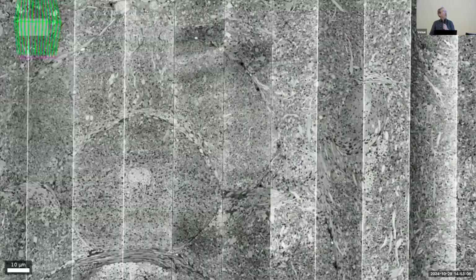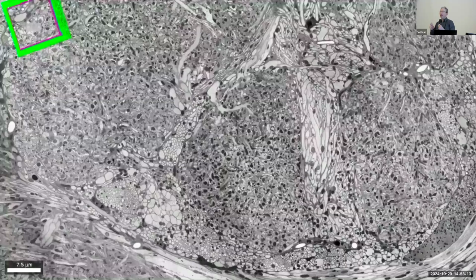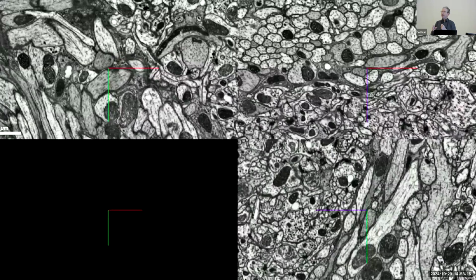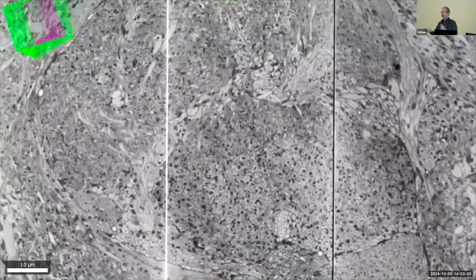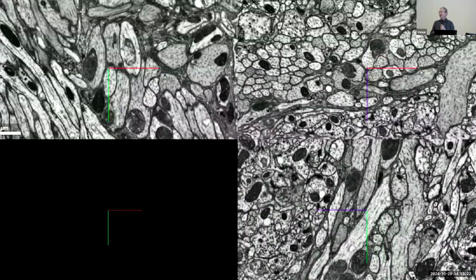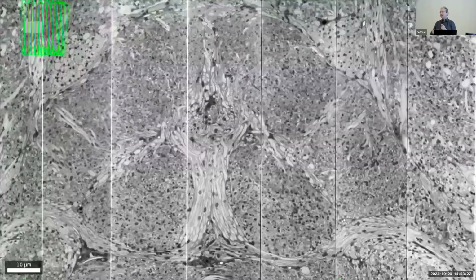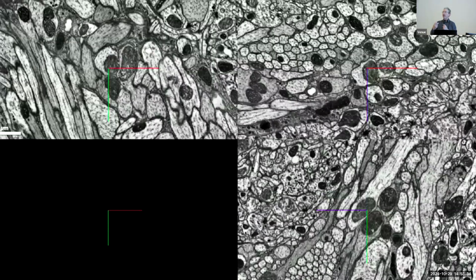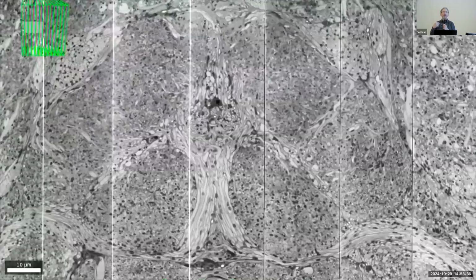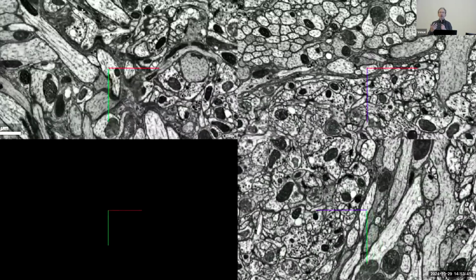So what we typically start off with is a small number of really, really large EM image volumes. For us, right now we're running about 50 teravoxels is how we would describe it. One grayscale volume could take us years in order to do reconstruction. So there's a tremendous amount of curation, manual curation, as well as automatic artificial intelligence curation before we even start using proofreading.